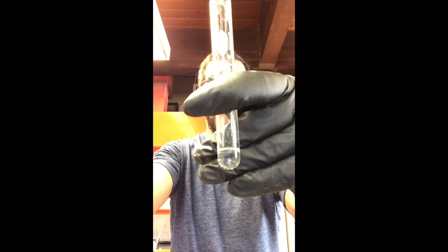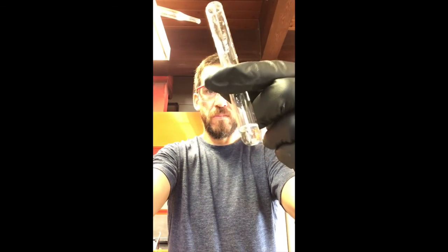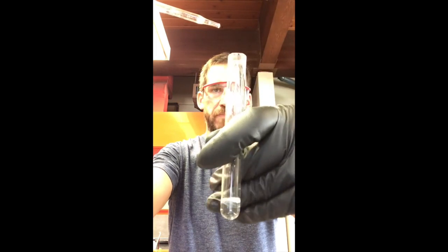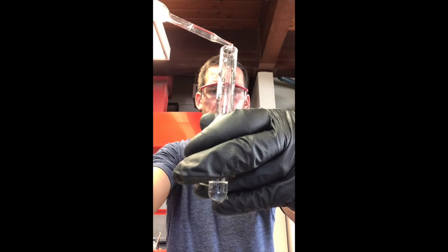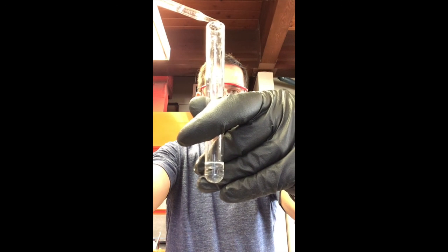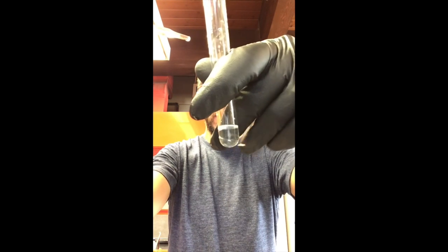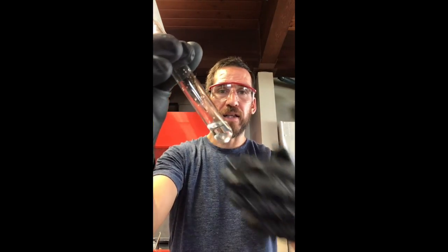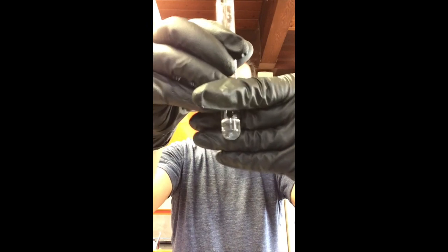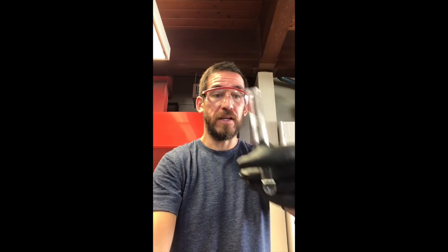Not super obvious yet. It's hard to see. You can see 2 layers forming, right? Remember, this one required a little bit of shaking. So now we can see that that second layer fell to the bottom. You can also tell by the volume of the liquid that's in here, right? So I only added a little bit of the unknown number 2. You can see that it is right there on the bottom. It dropped when I gave it a little shake. Okay, and if you want proof of that, how about this?